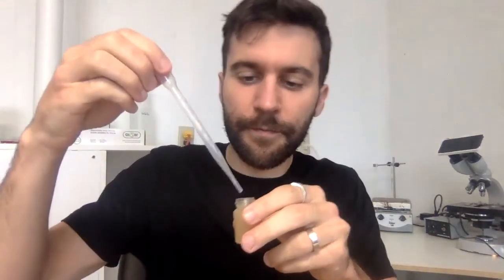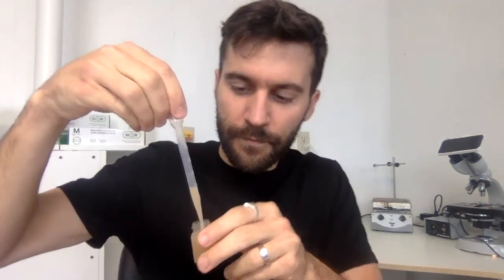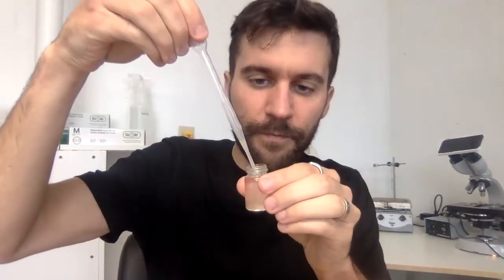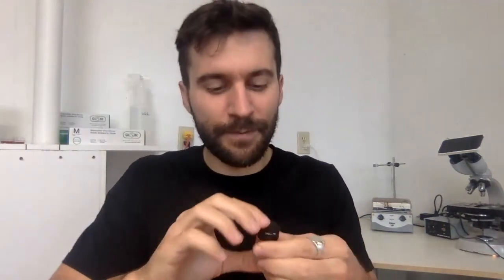So take a mill, add it to the next dilution. Oops. Maybe we'll put some nice music over this.